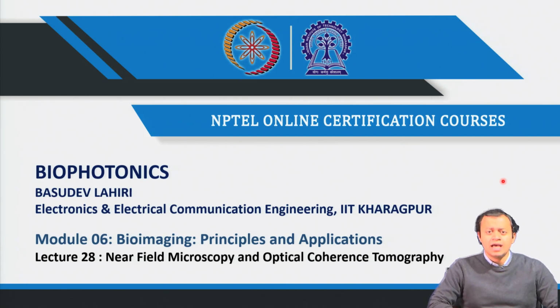I also told you that it is perhaps one of the greatest achievements of nanophotonics or biophotonics or photonics in general, in which we were able to bypass that diffraction limit and thereby develop photonic technologies, super resolution microscopy techniques that can boast of imaging one single molecule.